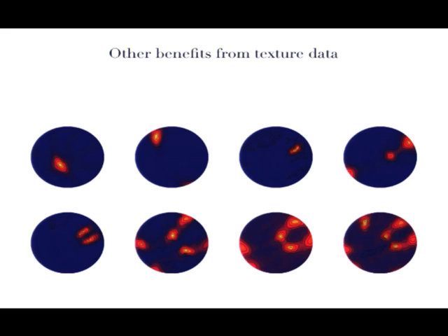Now this one is a series of pole figures we measured on a sample we couldn't index. It seems to have very large lattice parameters and is not too well crystallized, so we couldn't index it. But you can see that here this one seems to be single poles, so that could correspond to an axis of the crystal.